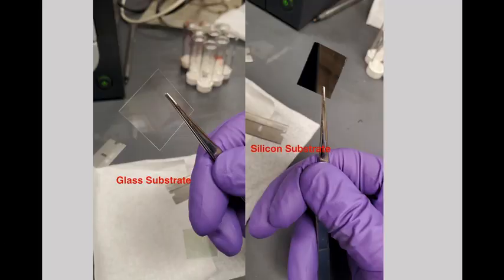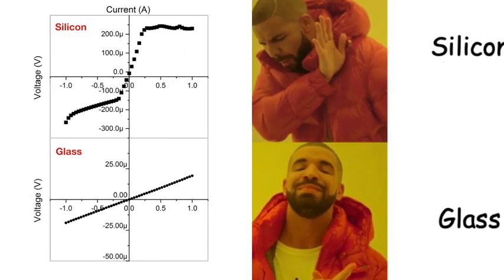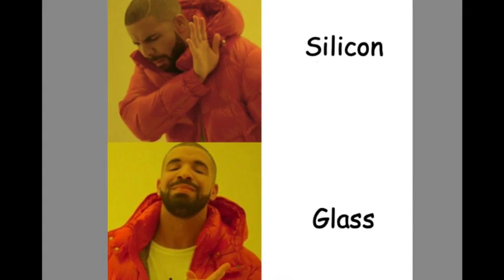We used both glass and silicon as the substrate. However, the probes will penetrate the thin films in four-point sensing, so we will only have a signal from silicon when measuring polyaniline conductivity. Using glass can avoid this problem.